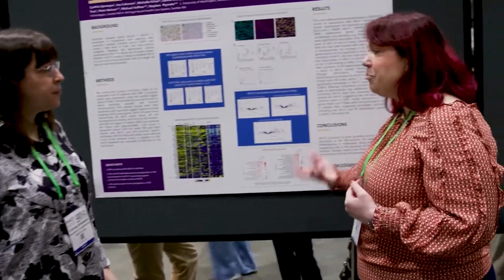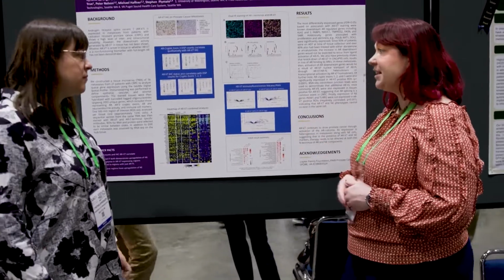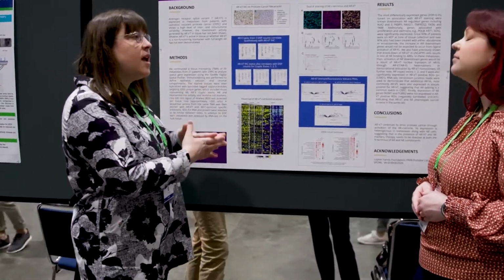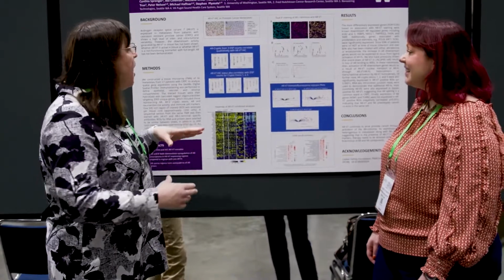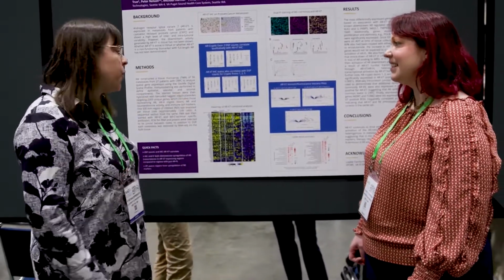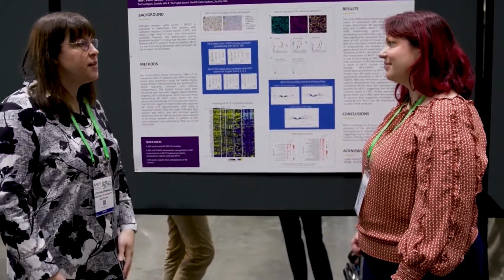Excellent. So have you planned any follow-up experiments to continue to use the GeoMx DSP? Yes, so when we started this, there were only 3,000 probes, and now there are thousands and thousands. So it would be great to actually go back and do this again, and especially look at this V7 with that larger transcriptome probe set and see what other differences we might see between the V7 and the full length.